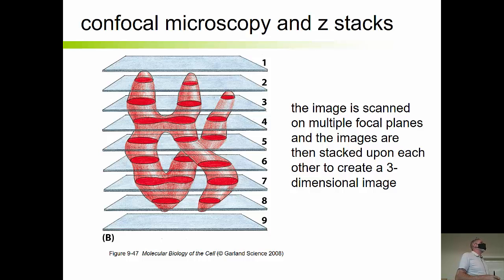Okay, so this is lecture 5, and in the last lecture, we looked at a microscopic technique where we could produce a true three-dimensional image, and this is called confocal microscopy. The basic way it works is that with fluorescent microscopy, we have this excitation and emission. So we excite the fluorescent molecule, and then we detect the light that will emit. And utilizing something called a confocal microscope, we can actually measure the emission from a single plane.